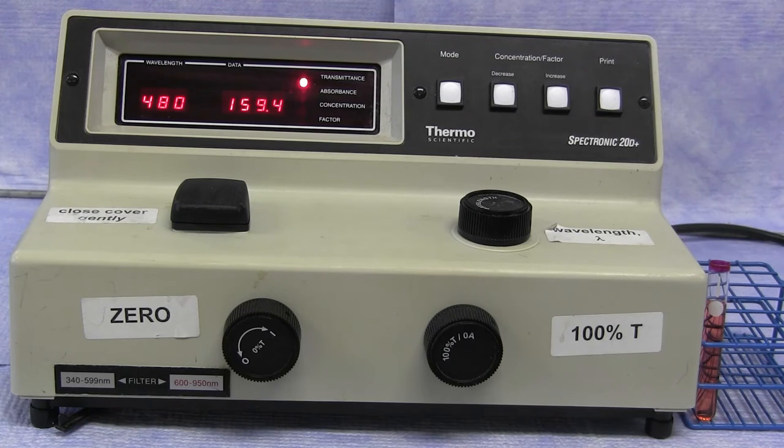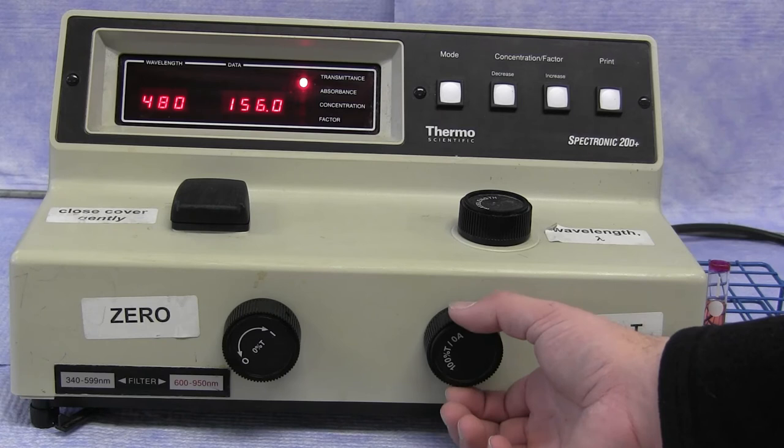With the cuvette containing your solvent inside the spectrophotometer, you can now use the right control knob and adjust this to 100% transmittance.